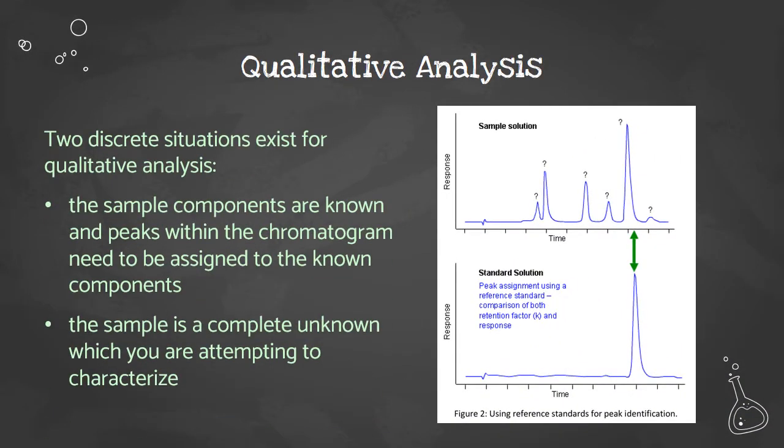Gas chromatography is widely used to establish the purity of organic compounds. Contaminants, if present, are revealed by the appearance of additional peaks in the chromatogram. The areas under these extraneous peaks provide rough estimates of the extent of contamination. The technique is also useful for evaluating the effectiveness of purification procedures.